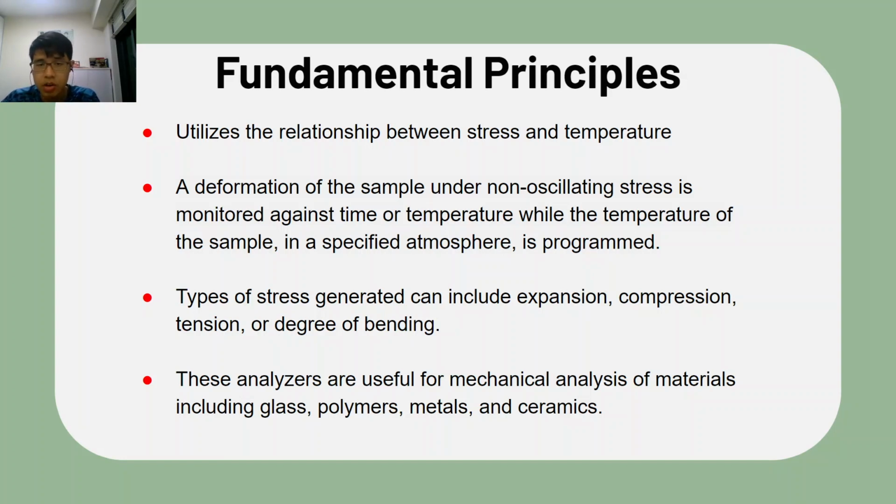Any types of stress generated can include expansion, compression, tension, or degree of bending. These analyzers are useful for mechanical analysis of materials such as glasses, polymers, metals, and ceramics.